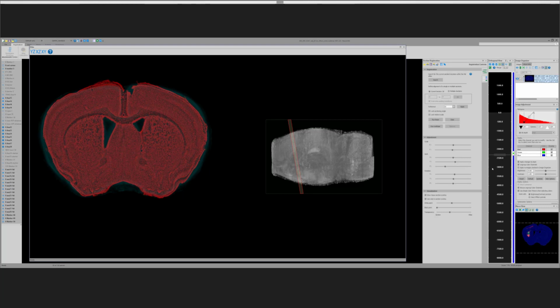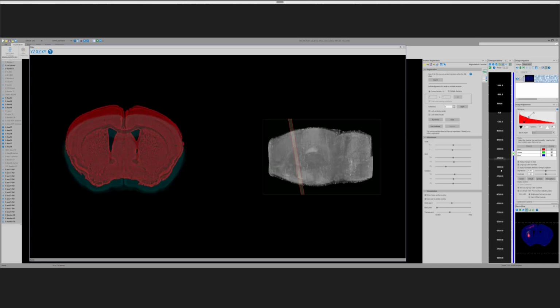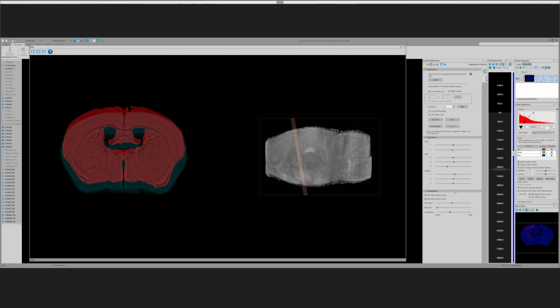And then I'll just do a few more. And I'll just jump in to say, of course, that the model that we have of the brain being sliced during sectioning: when you're sectioning, you keep all the planes parallel. The knife always travels through the brain in parallel planes, and that's why this particular approach seems to work really well.